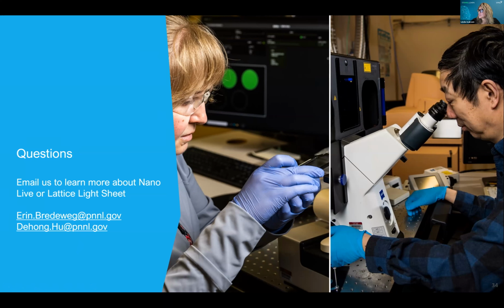And for Dehong, we have a question. Erica asks, do you see future applications for the lattice light sheet techniques in human and animal cellular biology? There are lots of examples in human and animal cells, but since at EMSL we try to focus on other things like bacteria and plants.